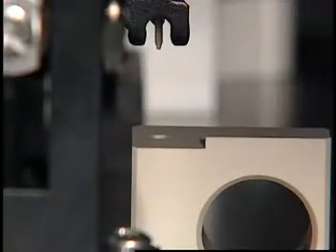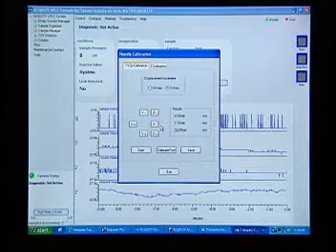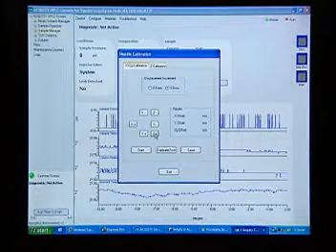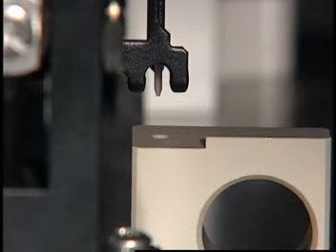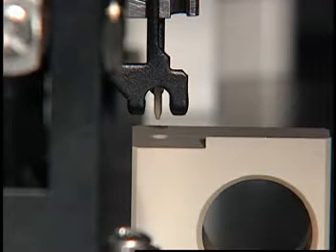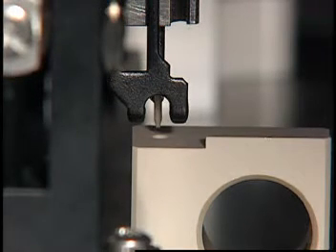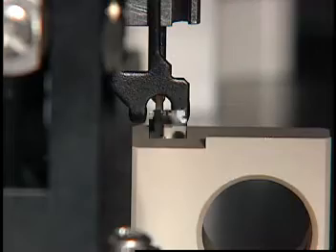Next, perform a visual inspection of the location of the puncture needle relative to the hole in the teach block. Choose the 1 mm displacement increment. Then click the Z+ button to position the puncture needle vertically to an approximate center above the hole. Each click of the mouse moves the needle 1 mm. Fine-tune the adjustment by selecting the 0.1 mm displacement increment. To laterally position the puncture needle, use the X+ and X- buttons to move it left or right, respectively.